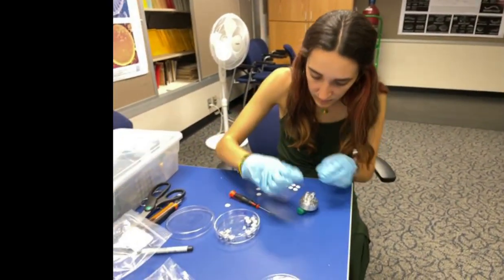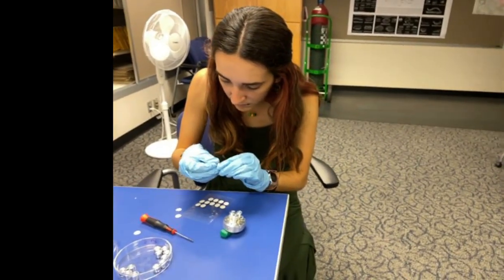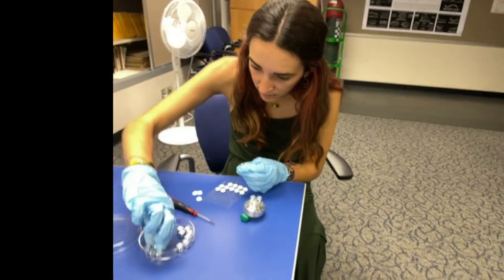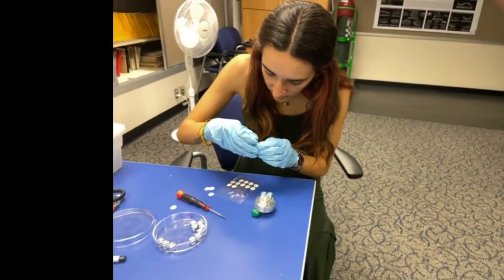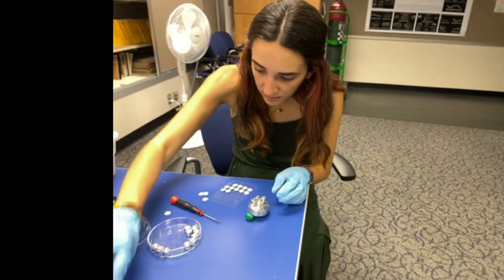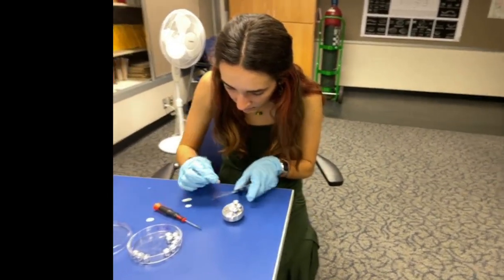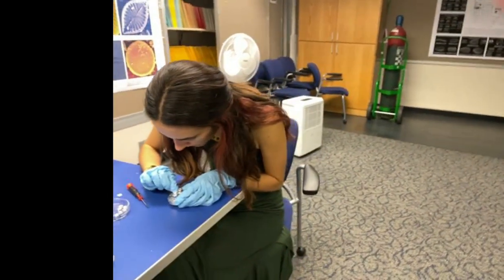So what I did is I just made 7 stubs, where we used to just have one, or actually we had 2, but one of them wasn't very densely prepared. And in these, I put as much as I could fit on each one of those little aluminum stubs. So they all have basically a full density of material on them.